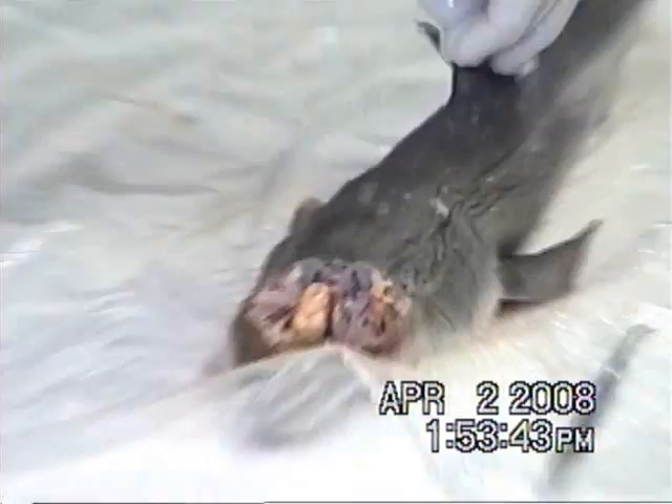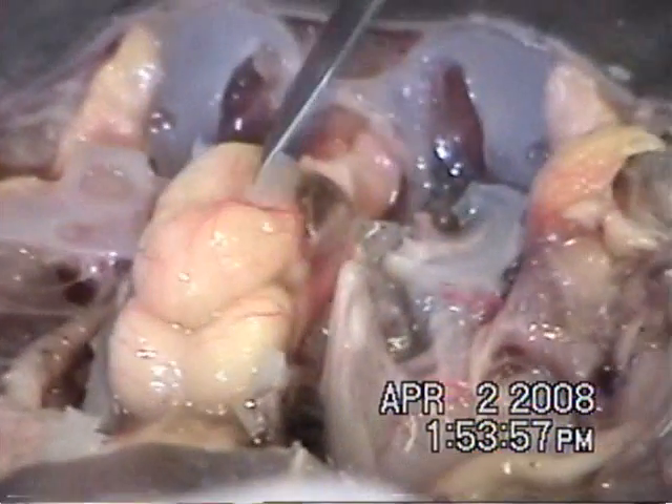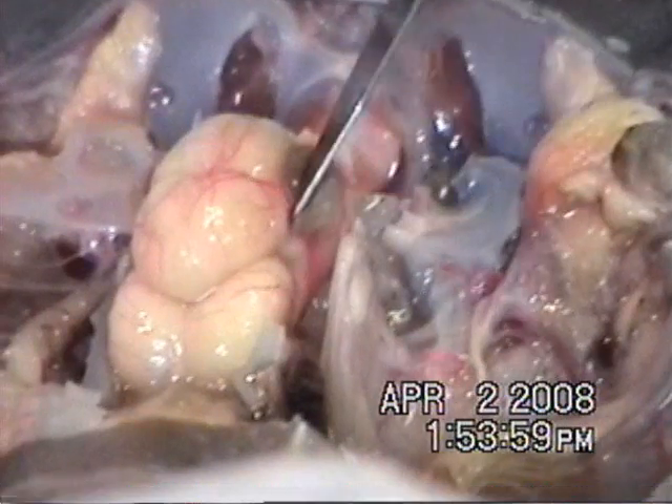We're doing the gill next. Pull the brain out — I'll touch it. It doesn't feel like anything. It's like rubber. It's soft and squishy brain matter.